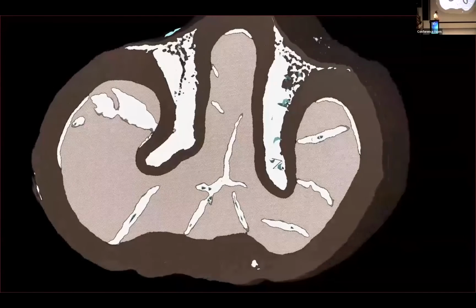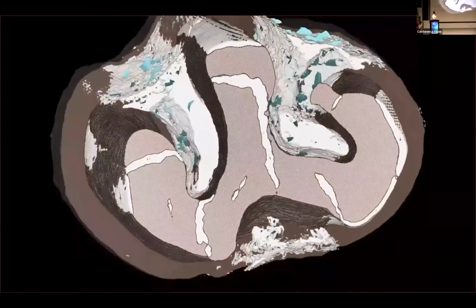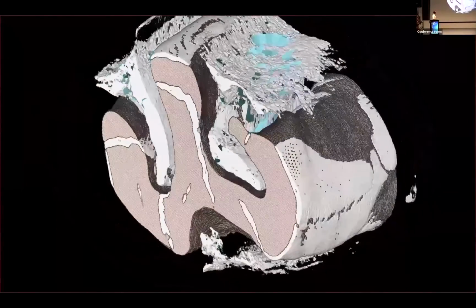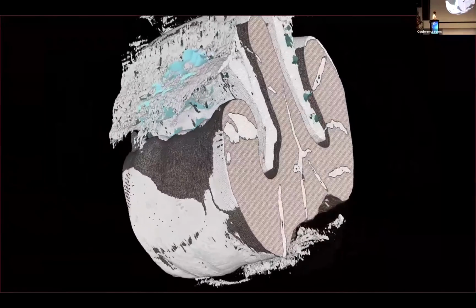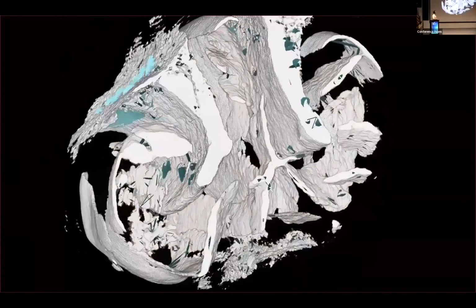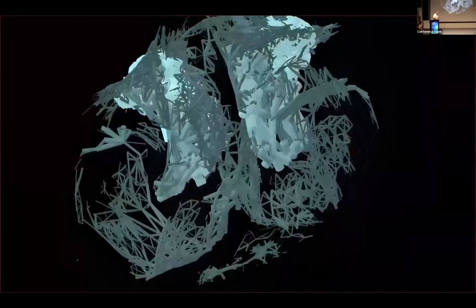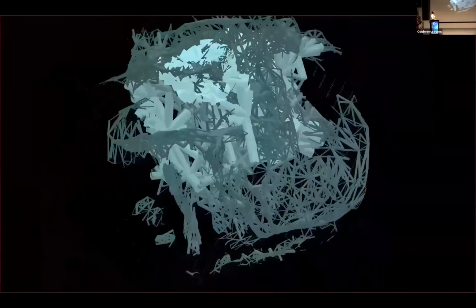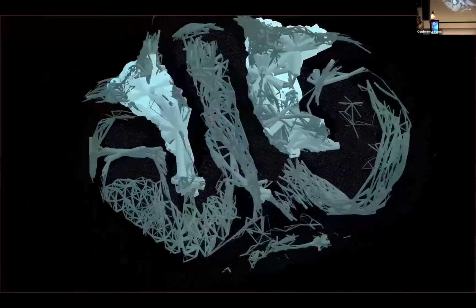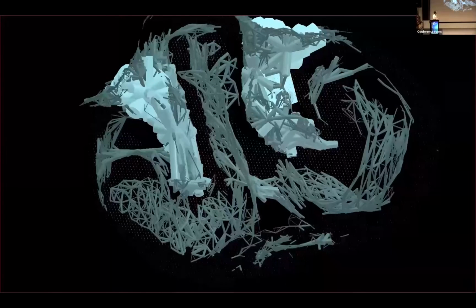And we can model this in 3 dimensions, right? So we have our integument on the outside of the grape seed. We have our pore space represented in white, and then we have the nucellus represented in this kind of peach color. And so, we can break it down into its different components and start modeling some of the things that are going on. So you can see this kind of bluish tinge on the inside. So that's a pore network model inside of the grape seed, right? And we can start looking at, quantifying the different size pores throughout the grape and get at the extraction efficiency from all the different areas inside of the grape seed.